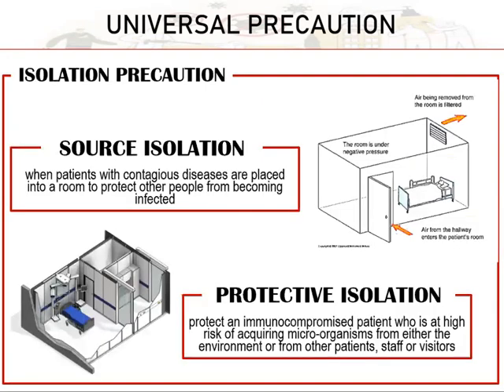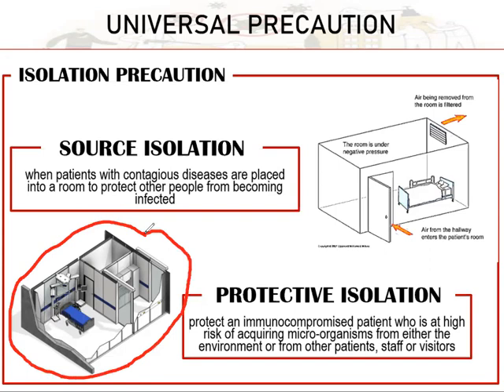The next one, class, is we have this isolation precaution. Okay, so this is the room setup of a patient who needs to be isolated. Okay, I'll give you an overview on unsa dapat ang himuon pag mukuha mo og dugo sa patient inside the isolation room. Dili man gyud na siya like the usual layout lang ang room sa patients. So, this is the main door. So this is where we enter, no? And then dili pa nato makita si patient immediately. So naa siya area here where we can put our things.